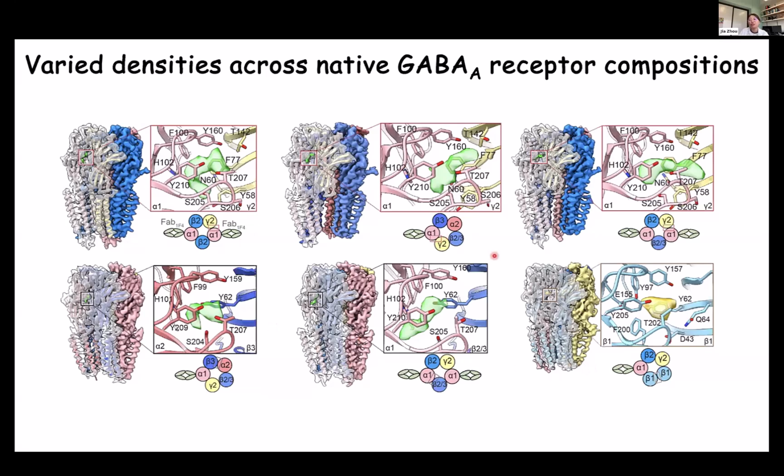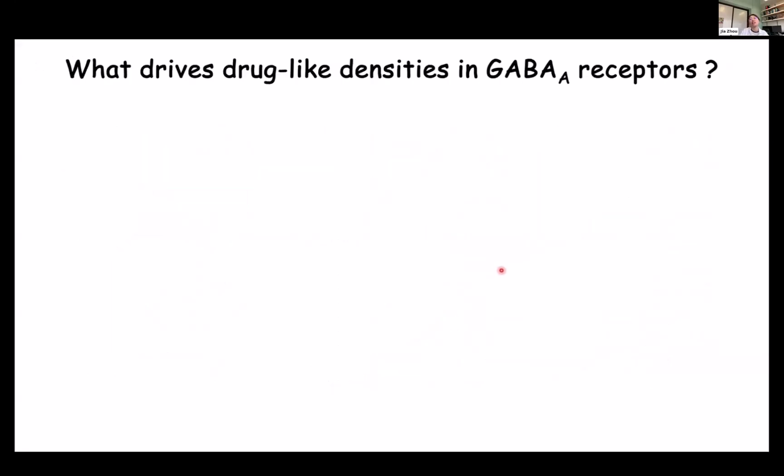All the density that we found at all the interfaces is very strong. Even if we change the threshold of the map, they are still there. So all this mystery density encourages us to move forward. Maybe it deserves for us to investigate what may contribute to them.